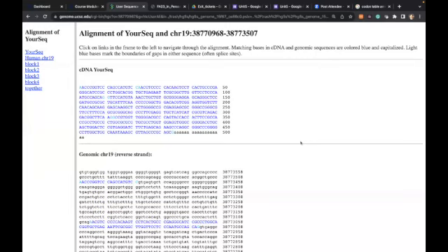And do you see the A at the end of your sequence, meaning that you just provide the mRNA sequence, mature messenger RNA, which already the introns are already taken out. So if you align your mRNA sequence to the genome, it will align here and there, taking out the introns. So basically, here is the alignment.